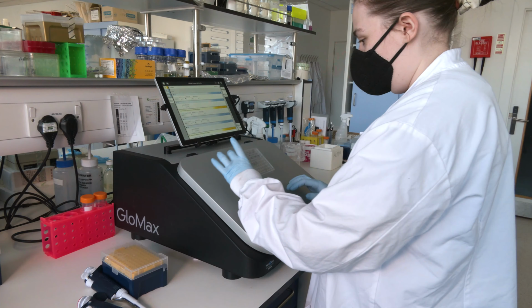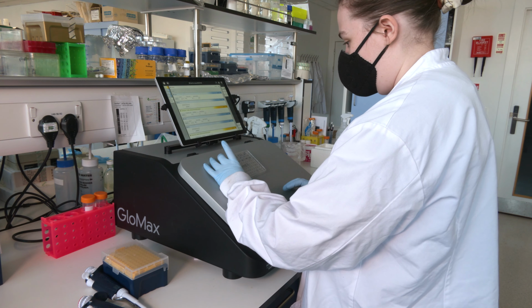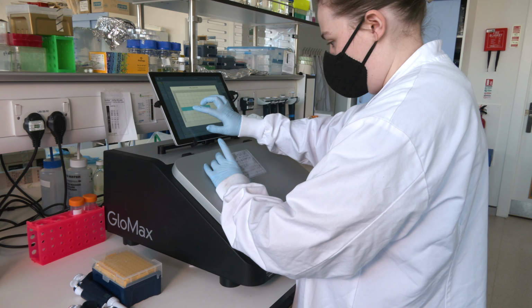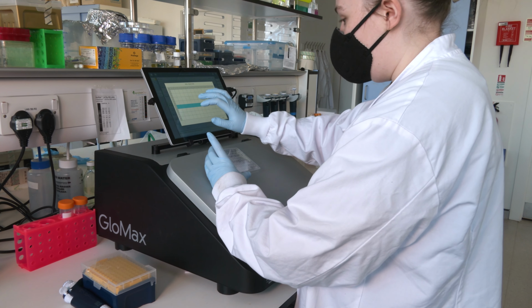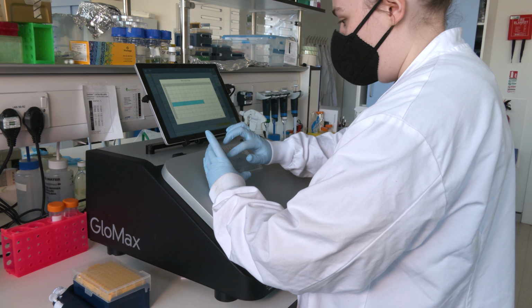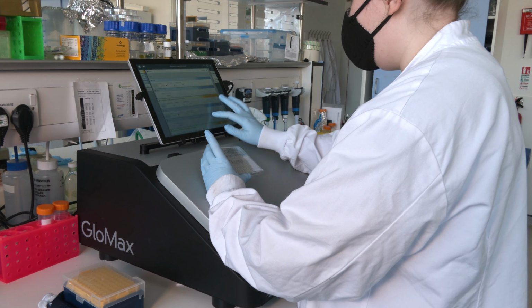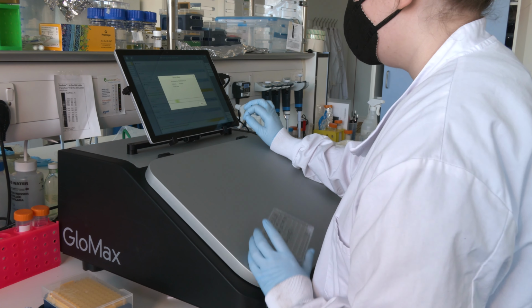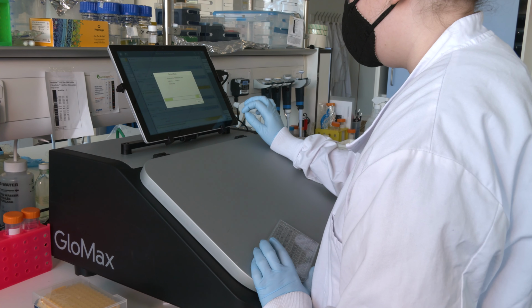And so by using a very short stretch that we insert, we hope that we avoid largely these deleterious effects on viruses. Being able to then probe the tag also with antibodies, for example, makes it possible for us to then also look at expression in different manners, to look at interactions and so on. So we probably get better data really by using a shorter tag that we can also use as a reporter. I would always point out that this specific technology has been extremely useful to our work and saved us a lot of time.